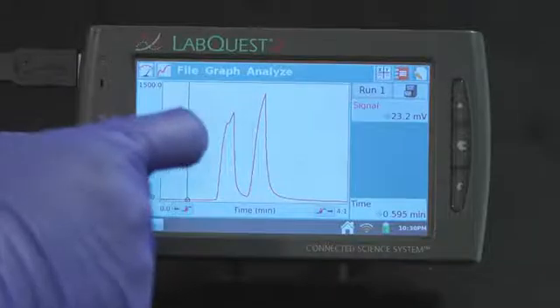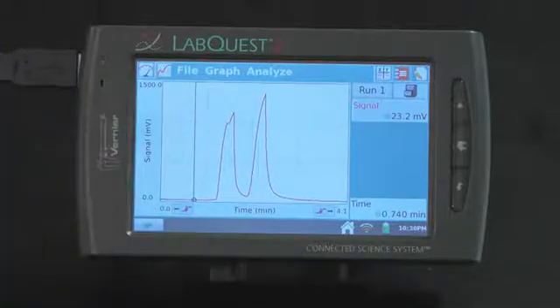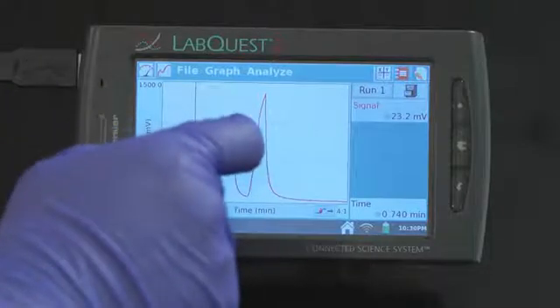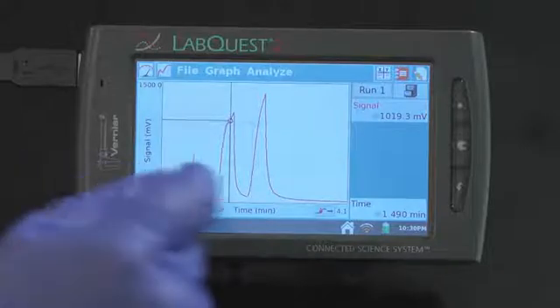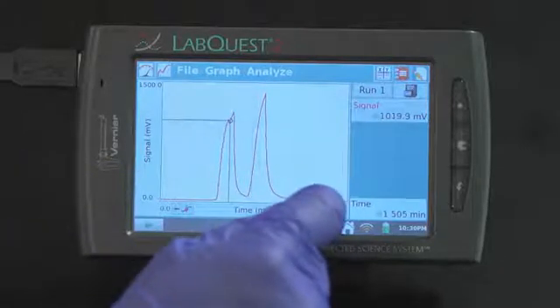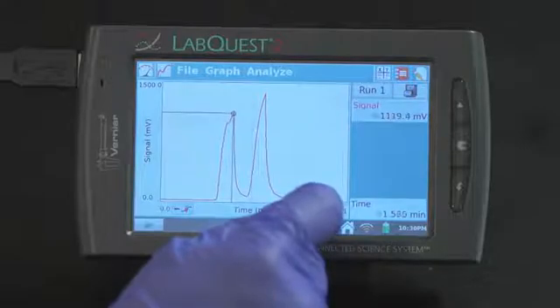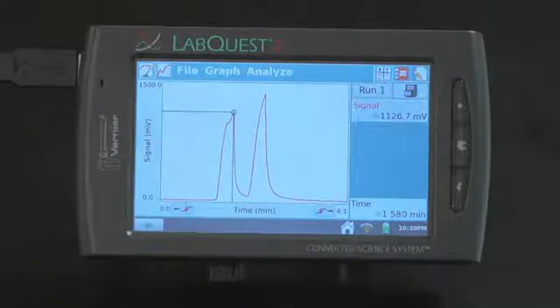To identify the retention time for a peak, tap on the graph on the screen. This will bring up the examine line. Move the examine line to the top of the peak by tapping on the screen. To fine-tune the location, use the nudge tools located at the bottom of the graph. The time displayed represents the retention time for the selected peak.